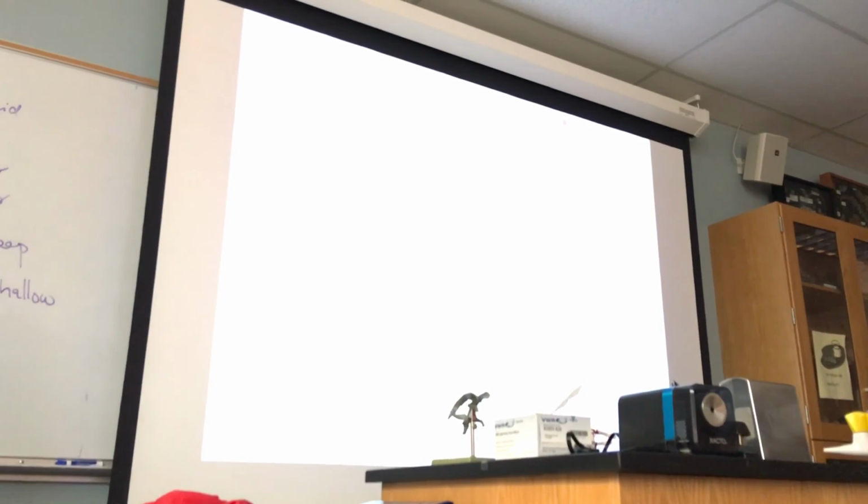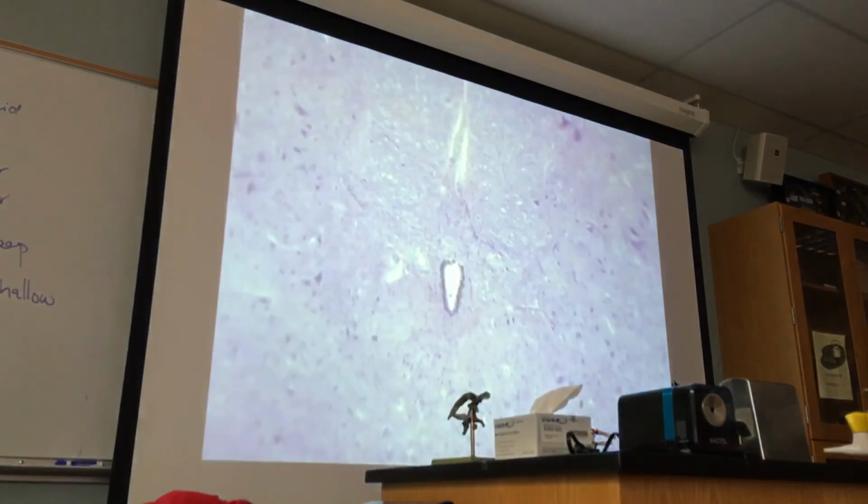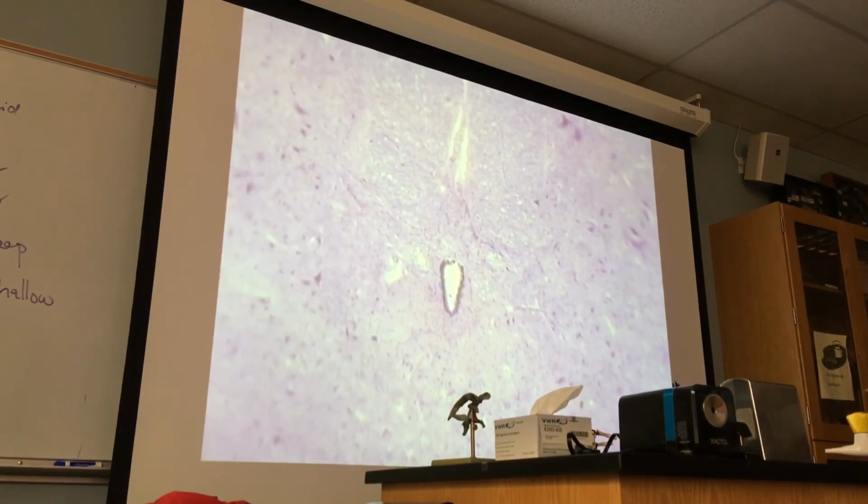In case Professor Mason forgets to show you the slides again, I will be showing you the slides again today, what we covered last time, okay? Will you focus that a little bit better? Yeah, it is not focused. Okay. Now it's like art. Is it good? I think so.